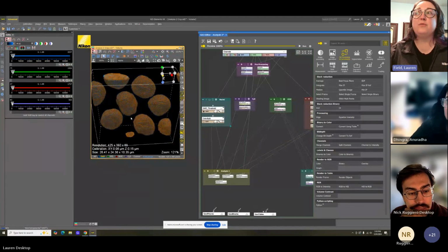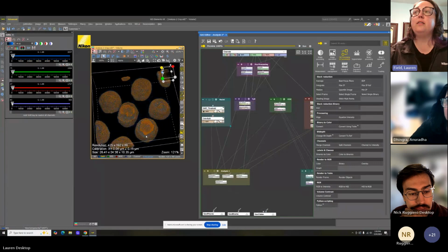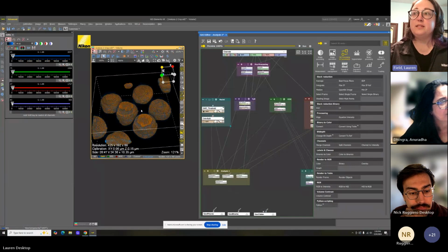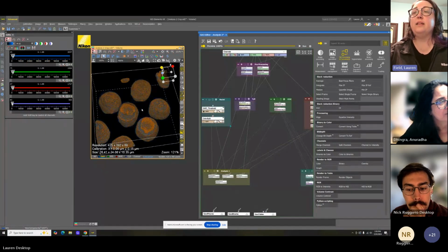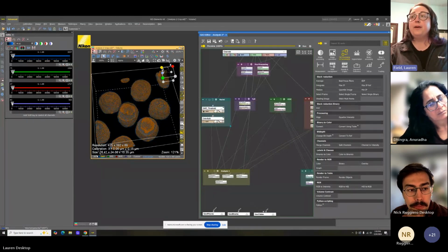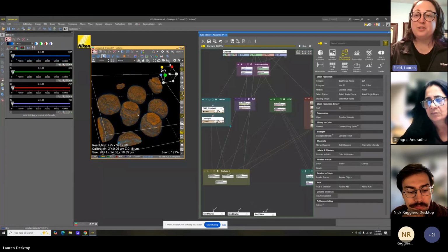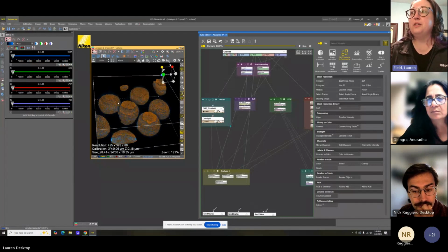I have these binaries rendering in this kind of a grid pattern. You can change a lot of that over in this section. There's not the equivalent of opacity in volume. It either displays it as this kind of outside grid, or you get a solid voxel-based structure that is opaque. For this rendering, I chose this just so that we could all see where the actual channel was and compare it to the signal underneath.